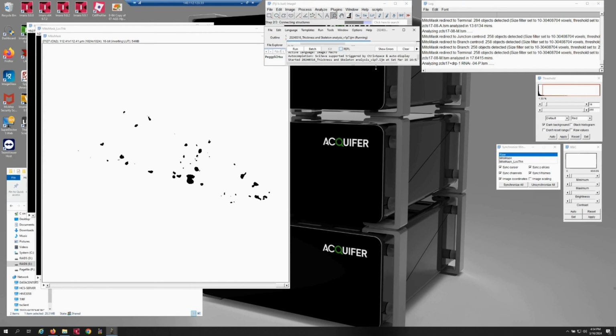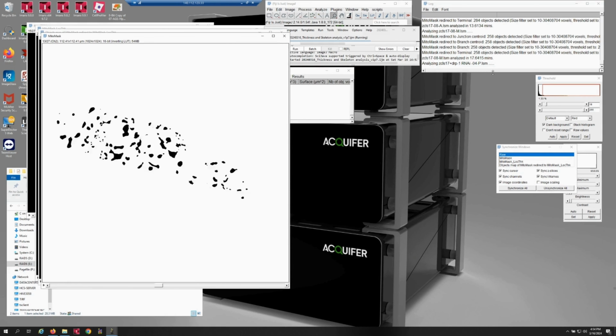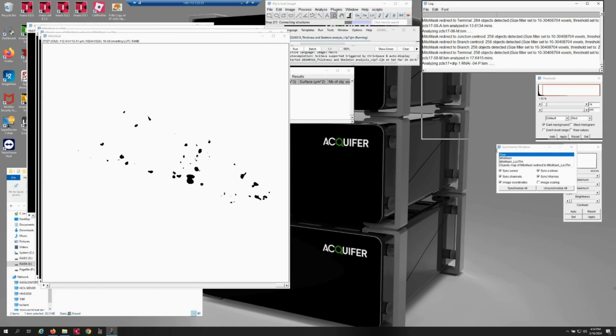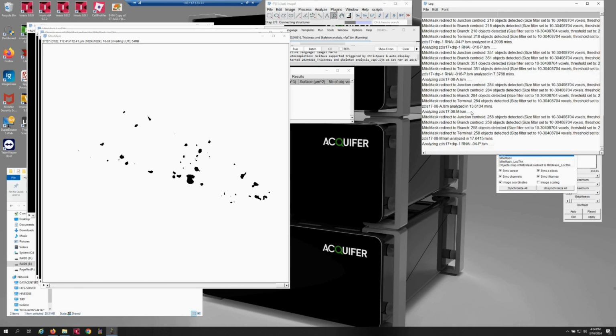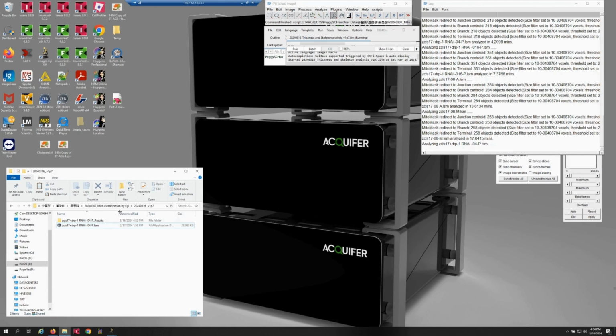Okay, good. Now, the log window on the right will tell you which file it's currently analyzing. And analyzing a file does take some time. The more mitochondria objects you have, and the higher the branch numbers inside, the longer it will take. But if there are fewer mitochondria, it might finish in about 4 minutes. However, if there are many, like in wild type where the branch numbers are very high, it might take over 10 minutes. During those 10+ minutes, you could more or less be studying, organizing images, watching shows, and then simply waiting. Now, let's take a look at the results.